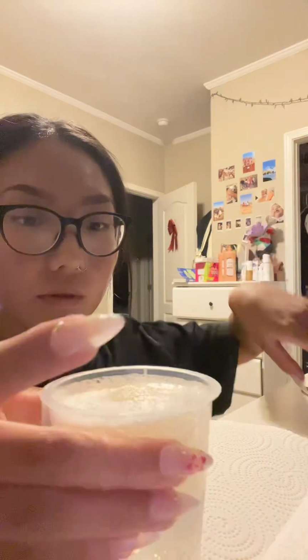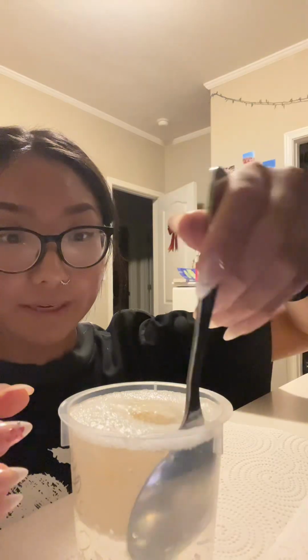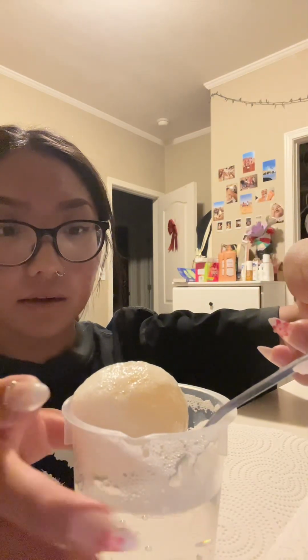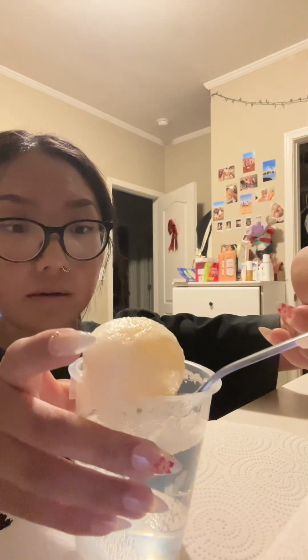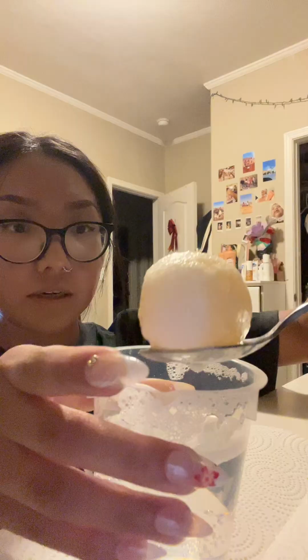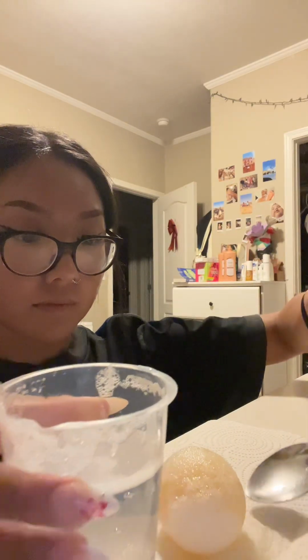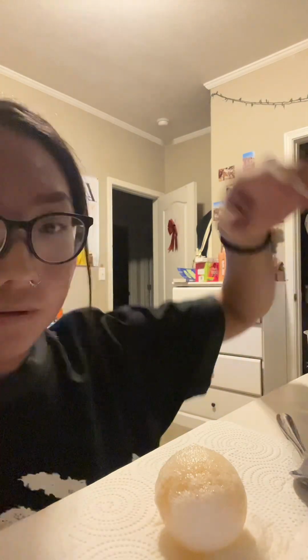So now I am going to take it out. I'm gonna use a spoon. Hopefully I can take it out. I don't want to break it. I'm gonna place it on the paper towel. All right. This is what the egg looks like outside of the vinegar.